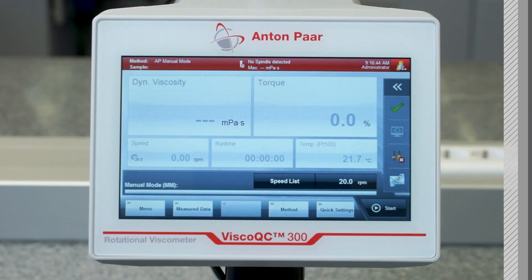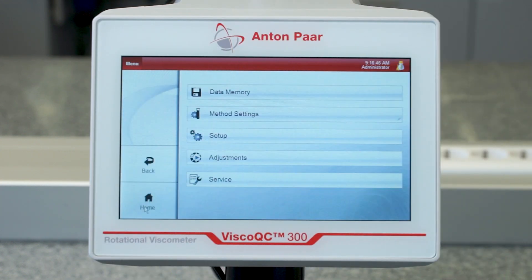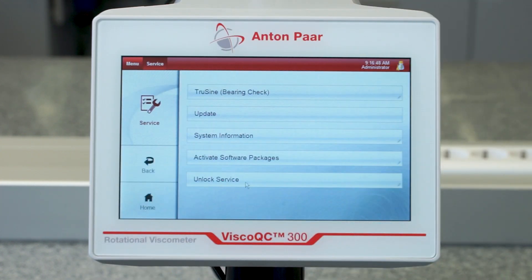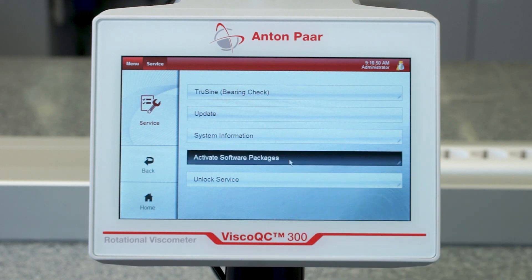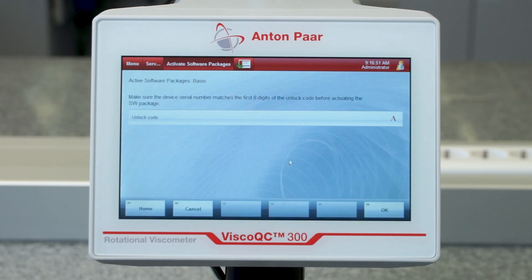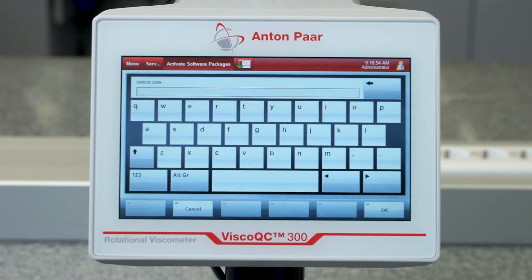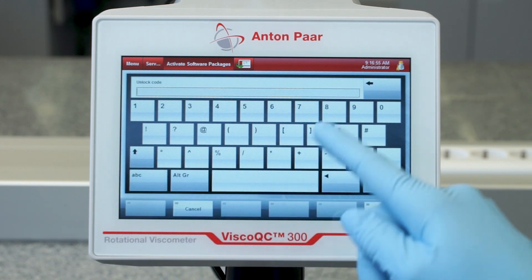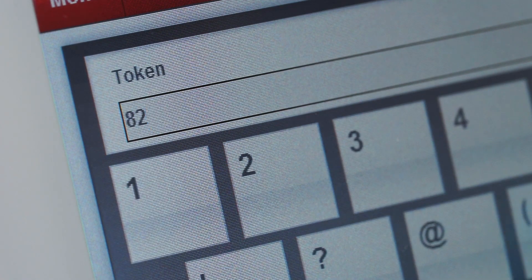By upgrading VSCO QC 300 with the optional software package V-curve, features such as the online graph for live measurement data, programmability of steps, analysis with mathematical models, and the determination of the static yield point with vane spindles are added.